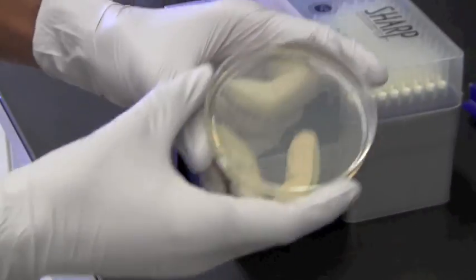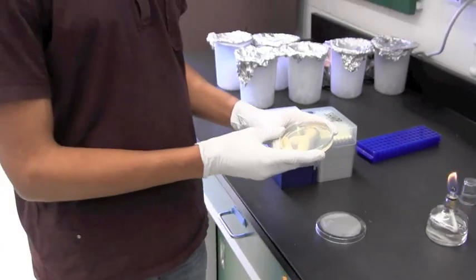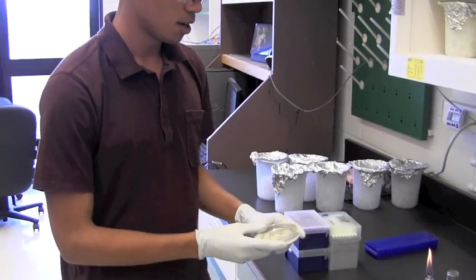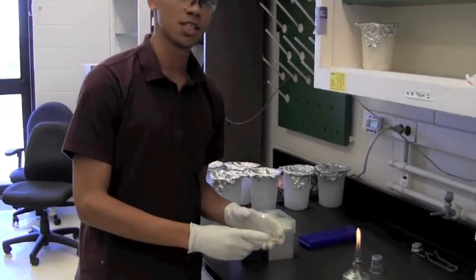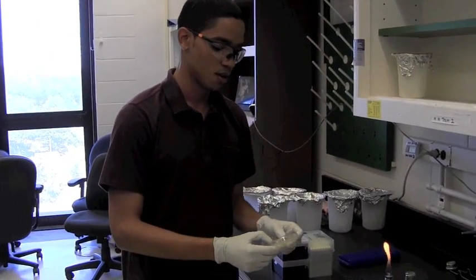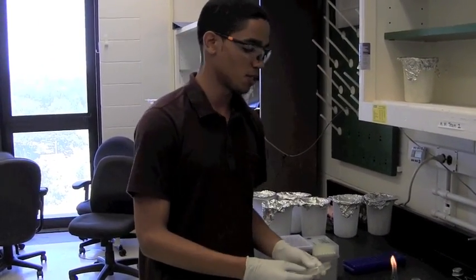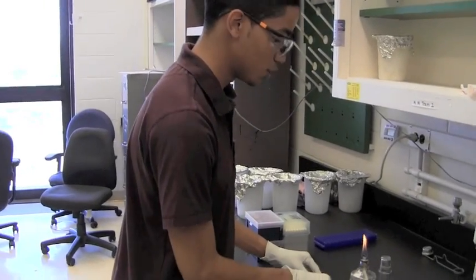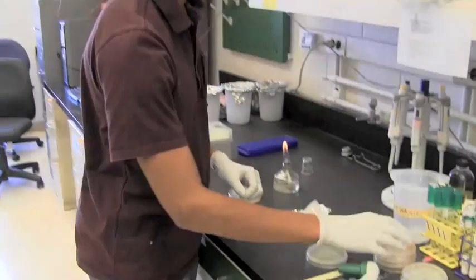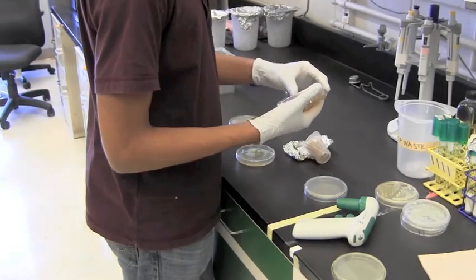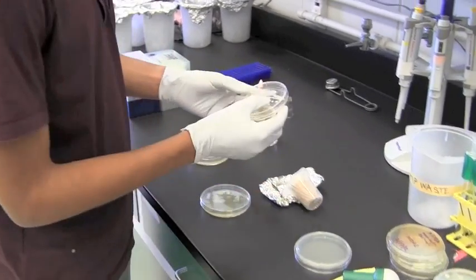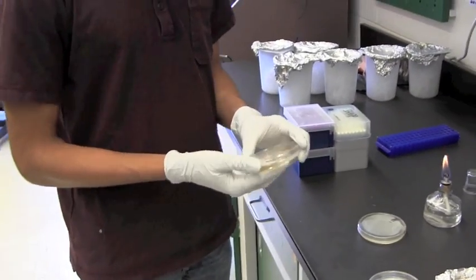So this is how you do a streak out plate and by tomorrow or a few days we should have single colonies that can be picked for your experiments of interest. Just to demonstrate what it will look like I have some old streak out plates that will show you what to expect.